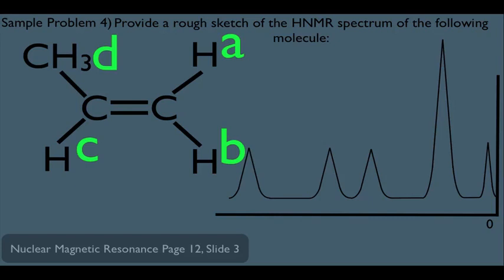Now remember, not only electronegative atoms cause your peak to be shifted, but also multiple bonds. In this particular example, we have a carbon double bond, so any hydrogens closest to that double bond will have more shifting. We'll go into why this is so a little bit later. But we can at this point assign the hydrogens to the given signals. Notice at first glance you might think the A, B, and C hydrogens are equal distance to the double bond. And in fact they are.